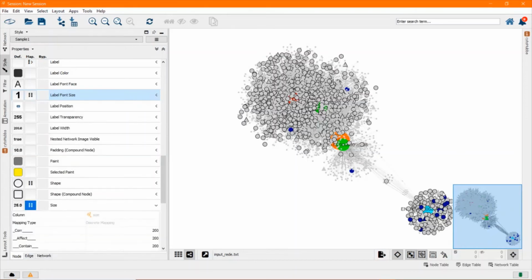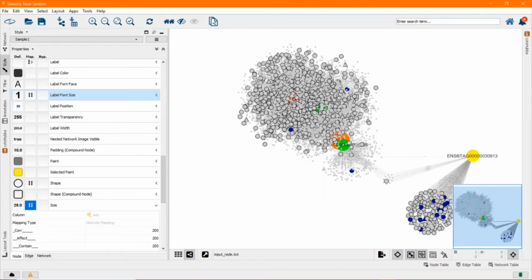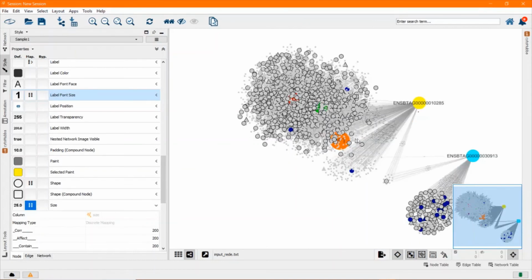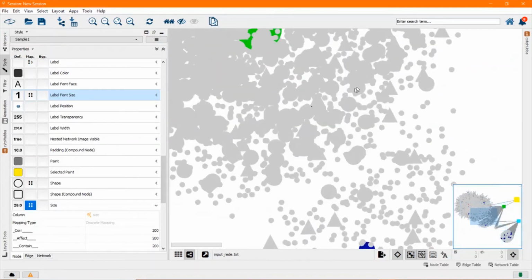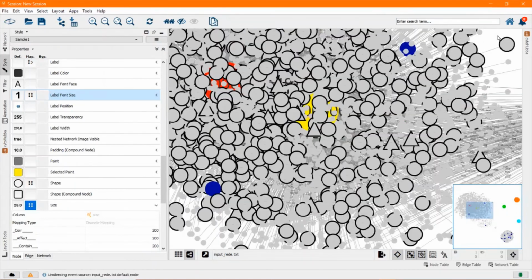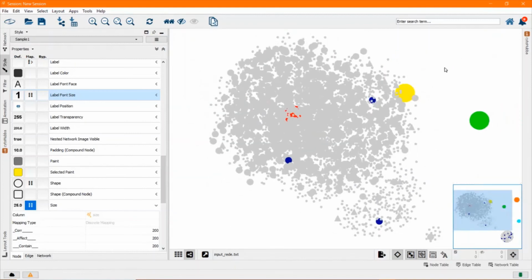So now I just want to make it better, like to put the things that are interesting to me in the right perspective. So here, this one too, it's correlated. Okay, this big one is the phenotype. You can make it like that, so you can select wherever you want. Make the goals whatever you want.